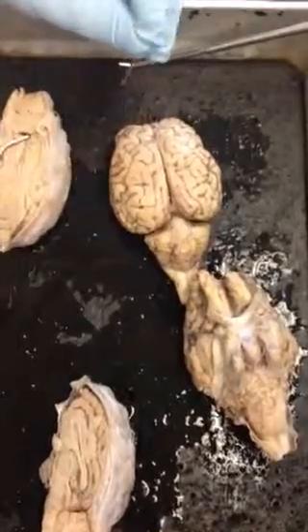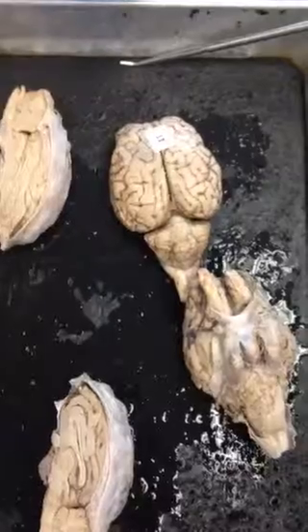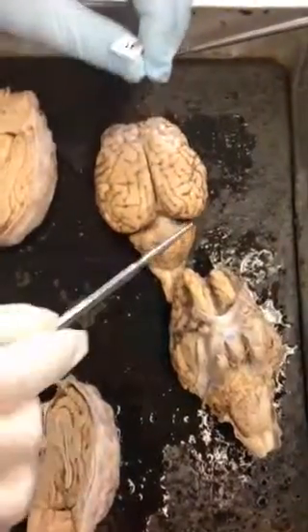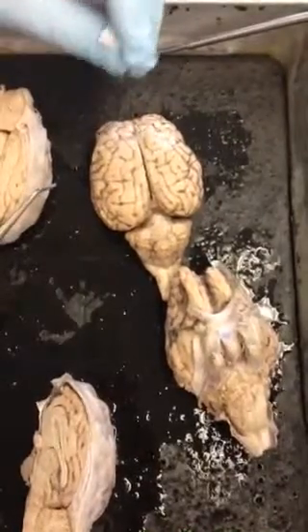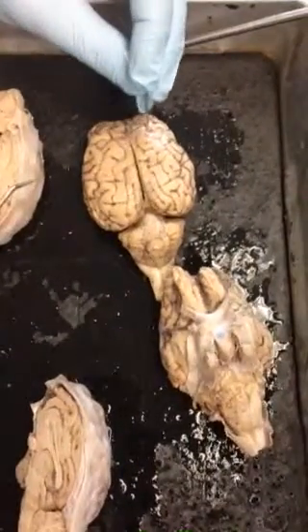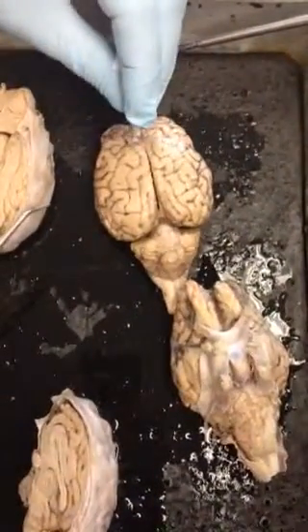Fissures? What are fissures? The deeper sulci. So what's that one? Longitudinal fissure. And the transverse is here. You don't have to know it though. Central sulcus. Kind of in the middle. Right there. So that's the central sulcus.